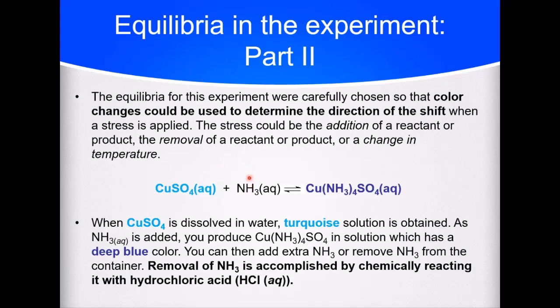By adding ammonia or removing ammonia, by adding acid, reacting this acid with the base would remove ammonia, we can get this equilibrium to shift left, light blue, or shift right, royal blue.